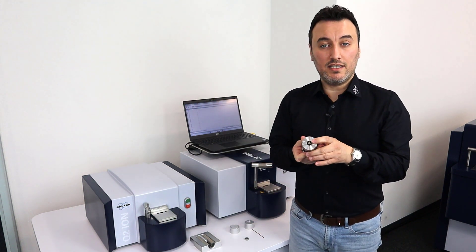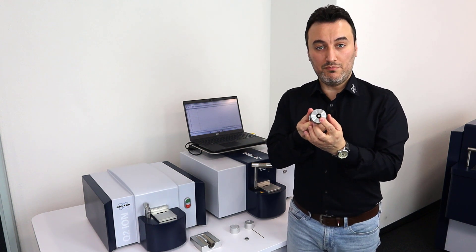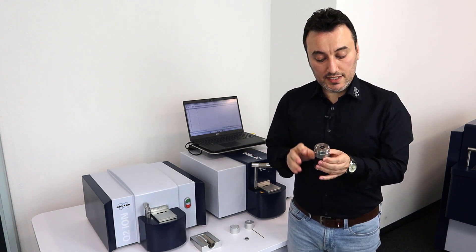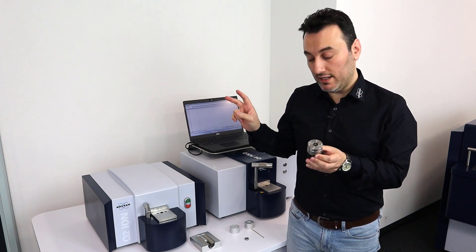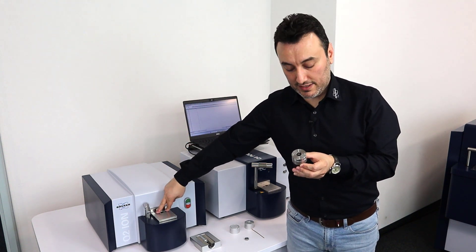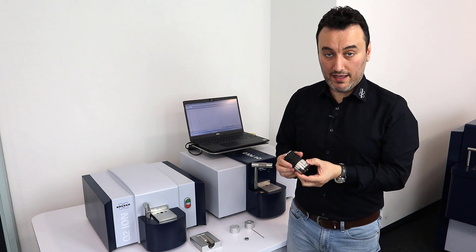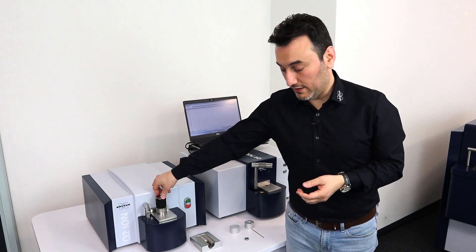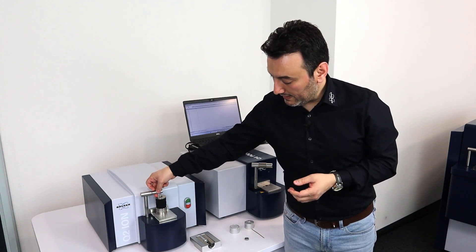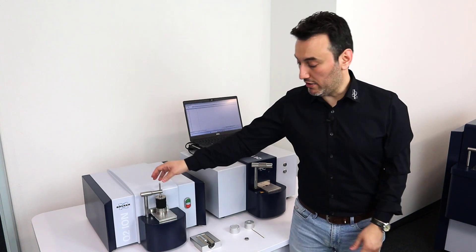My sample is now secured right in the middle of the sample adapter. As you can see, it has two pins, and these two pins go into two holes on the spark stand plate. All I have to do is take the sample adapter, place it on the spark stand plate, and then put the sample clamp on it.